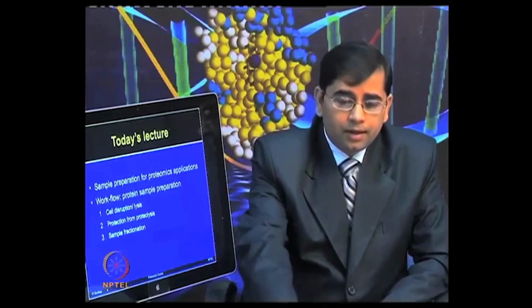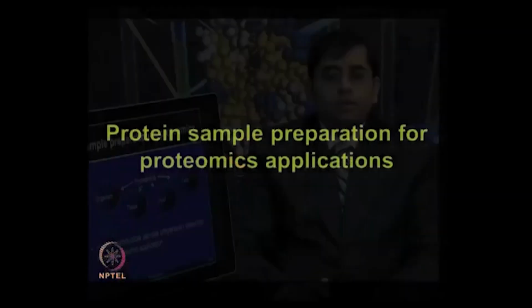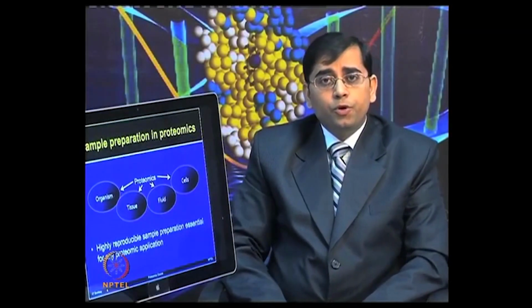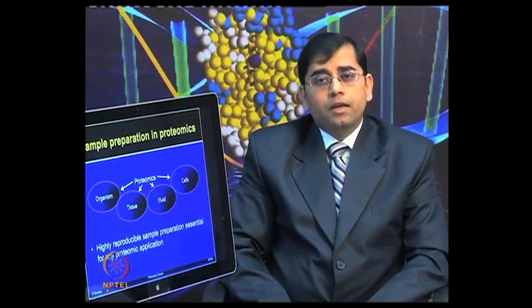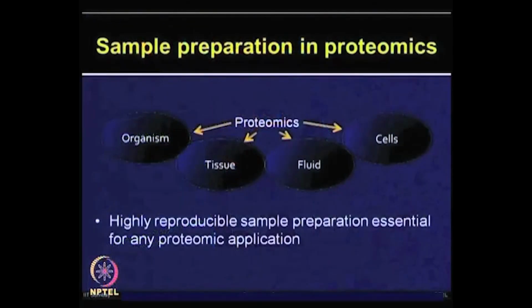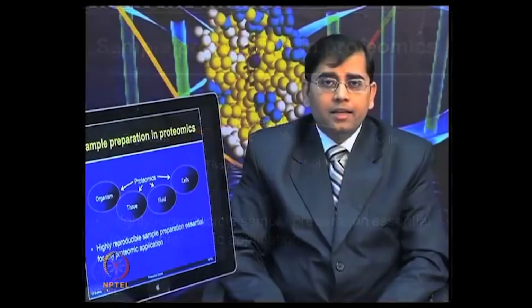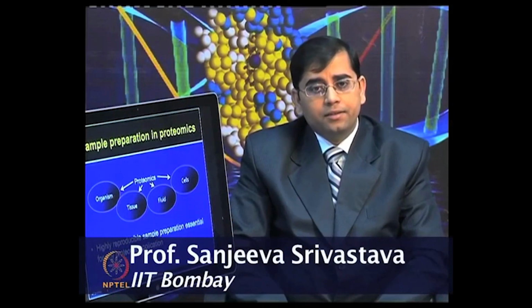So, let us start. Workflow for proteomic sample preparation. So, the proteome is very complex. Whether you want to perform your proteomic analysis for the whole organism, it means you want to know all the proteins present in a given organism or in a tissue or in body fluids or in different types of cells. Proteomics can be global or it can be very targeted or expression based.